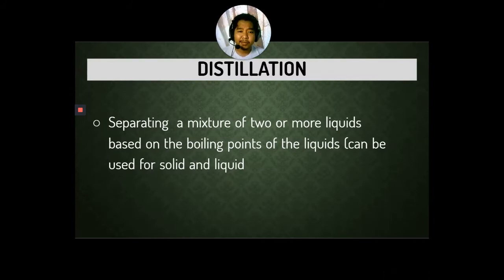This is the most complex of all. It's actually separating two or more liquids based on boiling points. This is a combination of evaporation. We also have the distillation, or the capturing of the water. And hopefully the video is done. I'll insert it here if the video is done. If not, I'll continue. So hopefully let's all watch this. This is the distillation process. Kung hindi naman, hindi ko na-flash, so backup plan, kasi hindi ko na-edit.